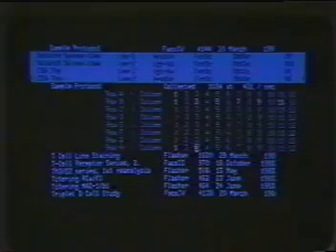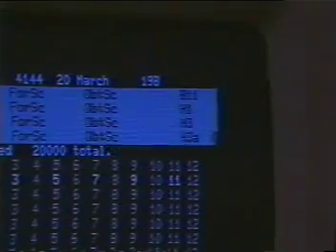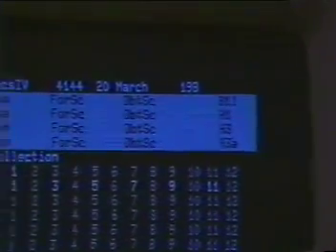Watch the collection process one last time. Here we'll collect data using a label that has been used once already, H3. We press Execute to view the label and press Execute again to begin collection. Notice the lowercase letter A, which distinguishes this data set from the previous data set that was collected using the H3 label.